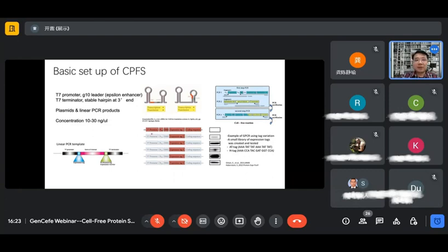And of course, you can move to the next round when you already get fewer candidates for beneficial mutations, and so on and so forth. Also, if you have a large number of proteins that need to be expressed, they are totally different, and this also saves your time for cloning.